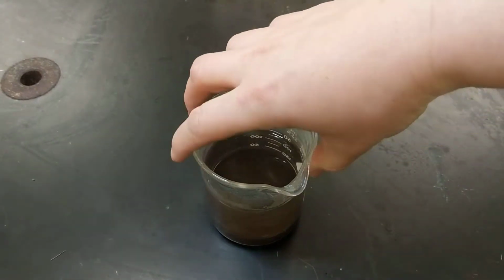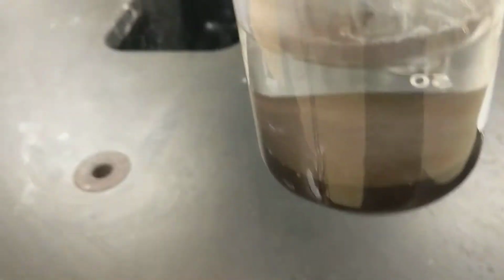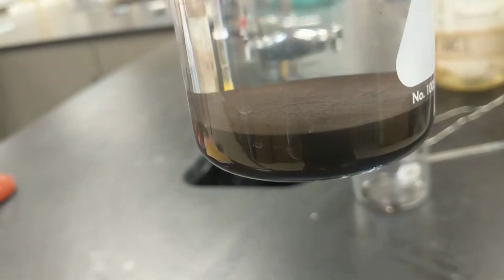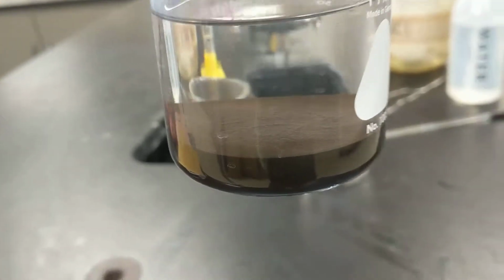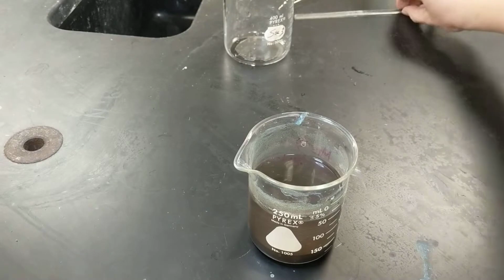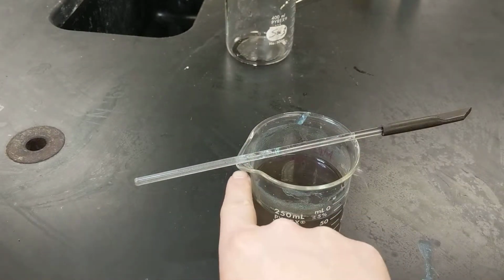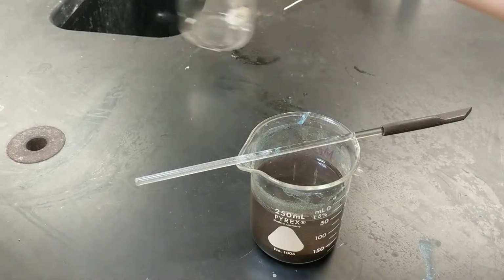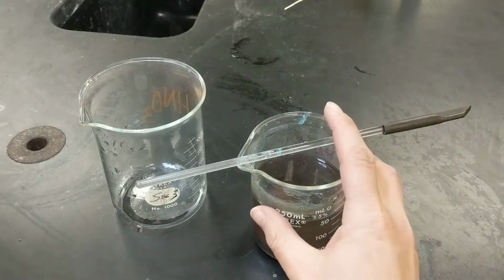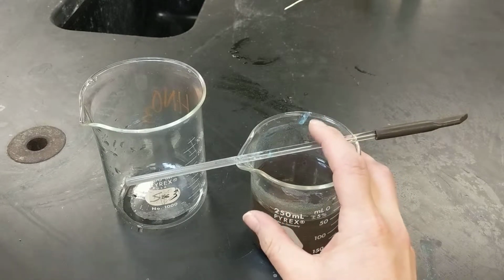So it's super important to have your solid be at the bottom, and then have all the clear liquid be at the top. You can see how it's just water at the top and your solid copper 2 oxide hanging out at the bottom. So what I'm going to do is take my stir rod and place it over the top so that it comes along the opening there. And then I have my other beaker here. I decant into the other beaker in case some of my precipitate comes out, so I can catch it.